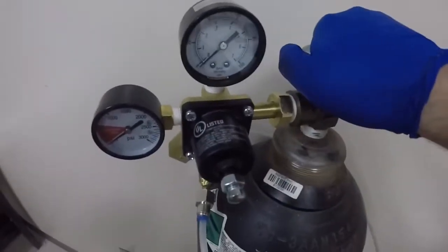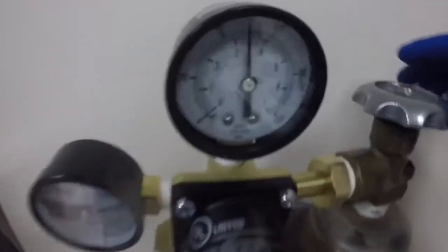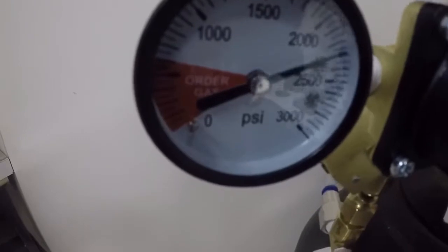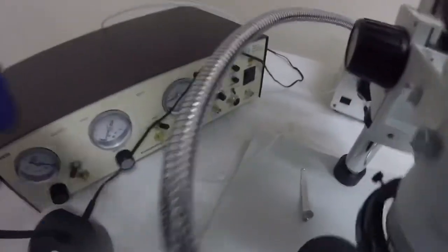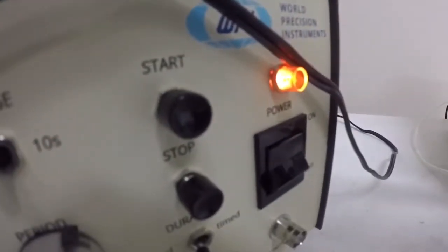Step 1, turn on your gas. You'll see the dials or gauges read that there is pressure. Step 2, get in here and flip your power switches. You'll see that light come on. Step 3, turn on the light for your microphone.